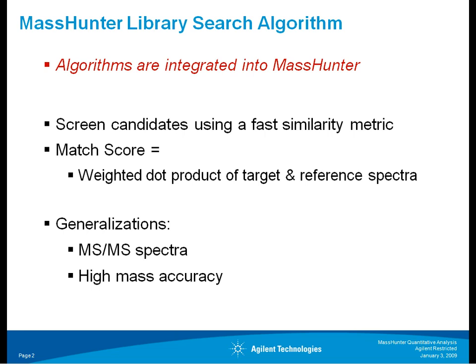And there are, of course, generalizations. This could be used with MS-MS spectra as well, and as mentioned, it could also be extended to a higher mass accuracy approach.